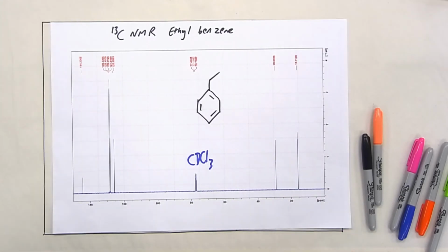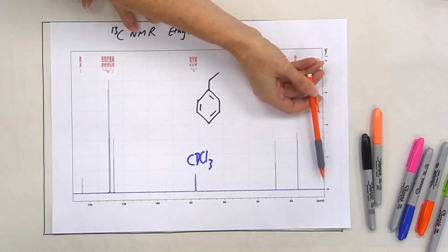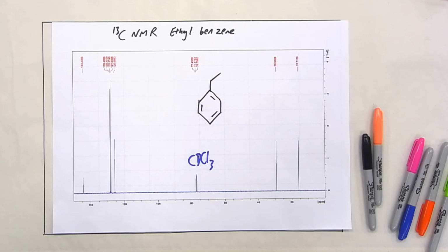First of all, we were going to make a quick note about the reference. One thing that maybe wasn't obvious in the video of the actual experiment itself is that a reference compound is included when they do the NMR spectrum. The reference is set to have a chemical shift of 0, and everything else is measured relative to that. In this example, we're not seeing the reference, and I don't think we do in any of the spectra we're going to see here. The reference would be at 0, and some of these spectra have been cut slightly above 0, so that you don't get confused by having the reference peak within there. So in this case there's no reference, which is why we've got the 6 peaks.